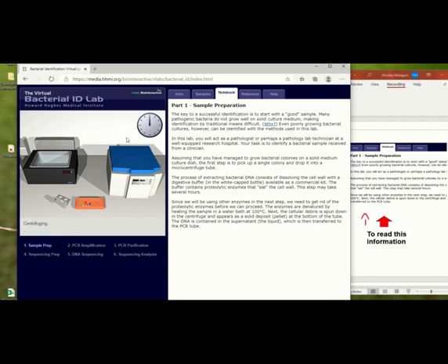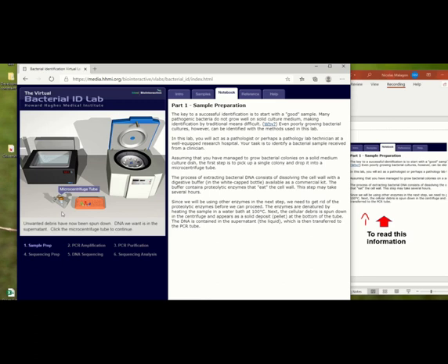This is the same. Now this will heat up the DNA, and now we will move it here. So the centrifuge here, it was heated. Here it spins, so it separates the DNA.